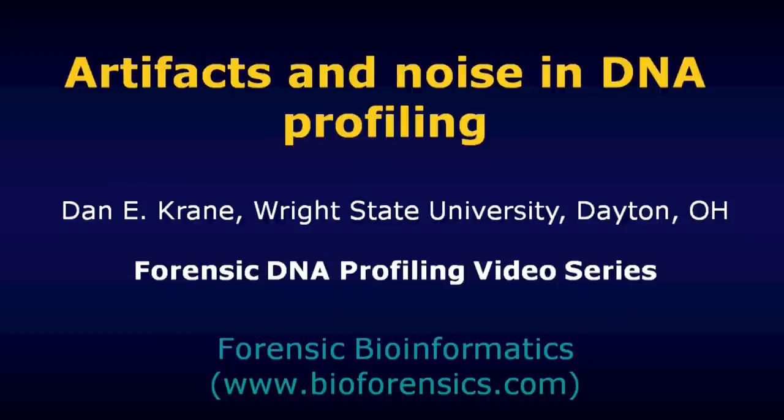And this video is going to be my chance to talk with you a little bit about some artifacts and noise issues that come into play when we're interpreting forensic DNA profiles. In short, things that can make DNA profile interpretation just a little more complicated than I think any of us would like.